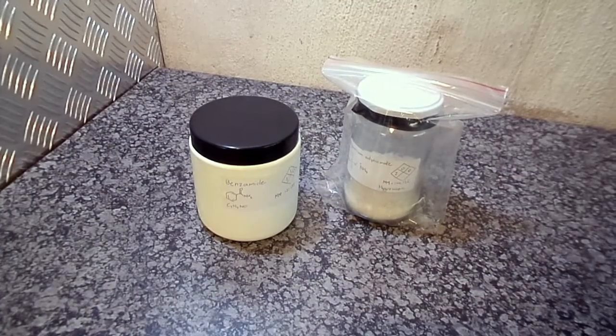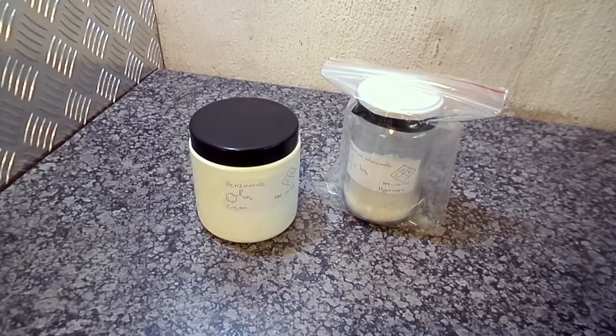Hi YouTube and welcome back to my lab. Today I'll be synthesizing benzonitrile.